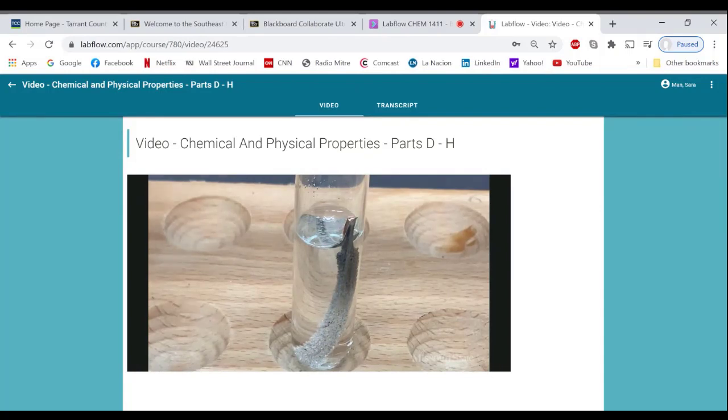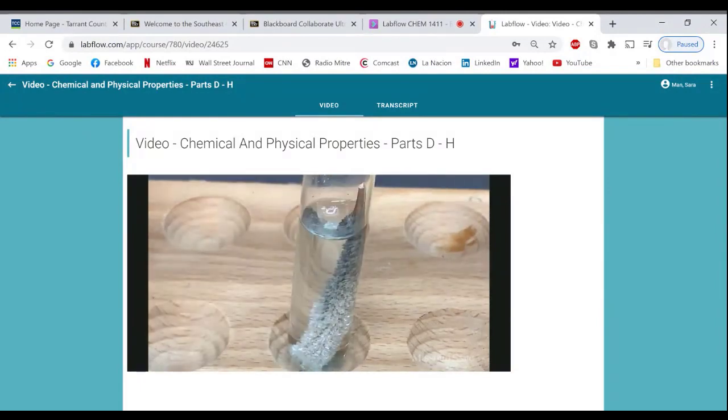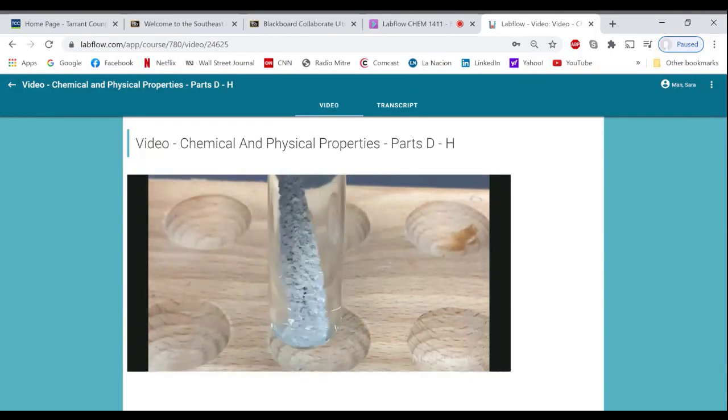The shiny reddish brown color of the copper are added to a colorless solution. And what happens? Look at the color of the surface of the copper. It has a different color. It's now silver.